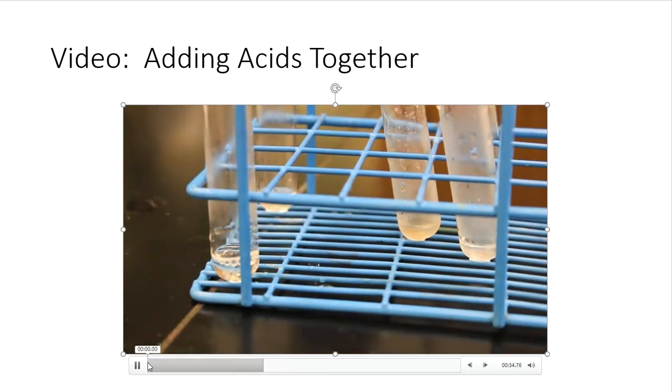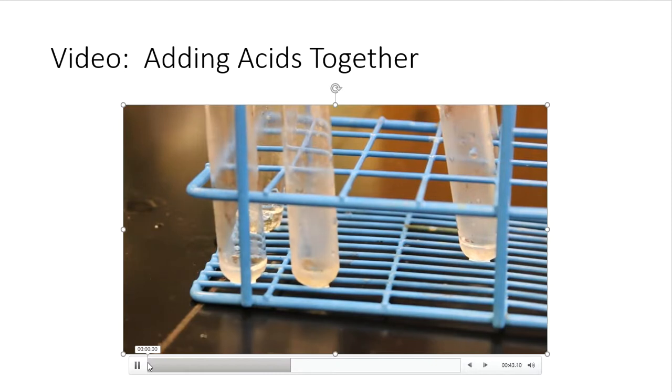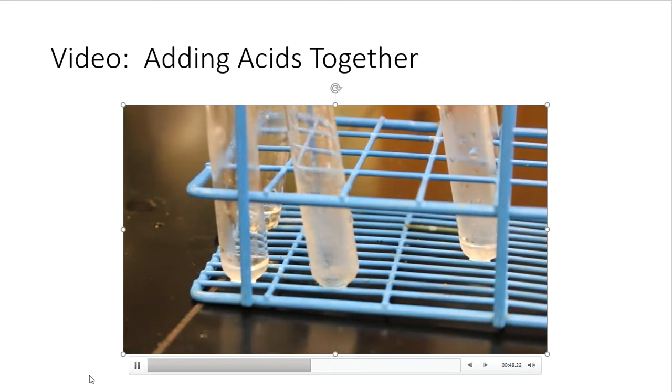So we mix the two acids together. I do this 2 more times because we've got 2 other methods and labs that we're doing. So I'm just doing 3, and we'll just do it in one fell swoop. So that way we can take care of all 3 of these labs in one video.